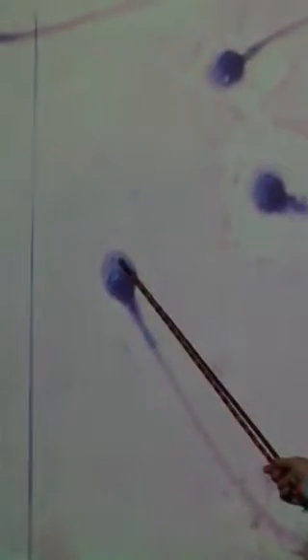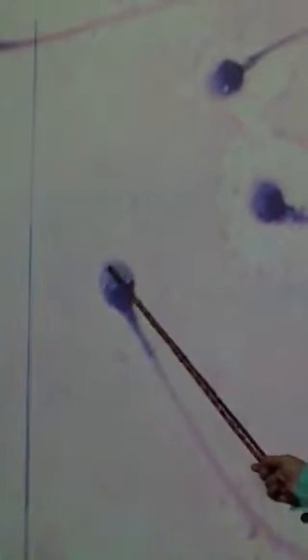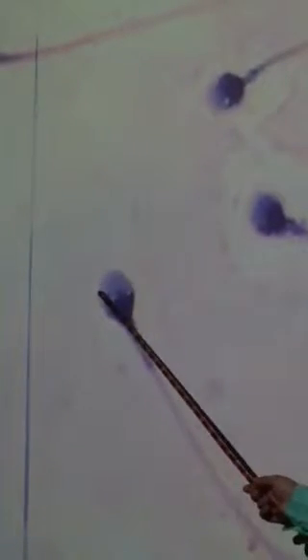This one shows you actually, what's the lighter area on the top called? Anybody remember what this is called? Okay, maybe we didn't get to it in lecture, but this is the acrosomal cap. This is the remnants of the Golgi apparatus, which contain hydrolytic enzymes. Because remember, the Golgi segregates lysosomes from secretory proteins. Anyway, here's your condensed nucleus covered with an acrosomal cap. Here's your midpiece, which is the helical mitochondria. And here's your flagellum coming down.